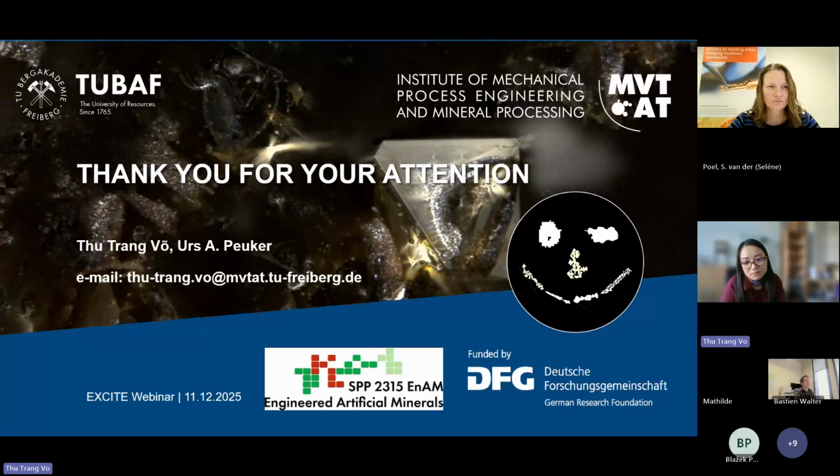Yes, within 5,000 newtons. I would say it's quite precise. The fluctuation is between, I would say, minus 0.5 and 0.2, but not more than that. So if you need to break something at 2 Newton, then it's not precise.